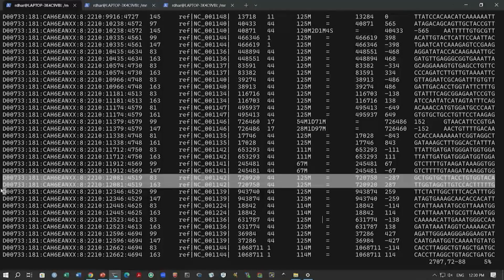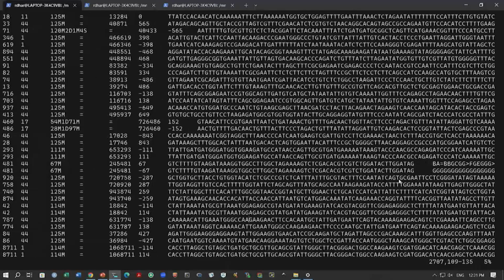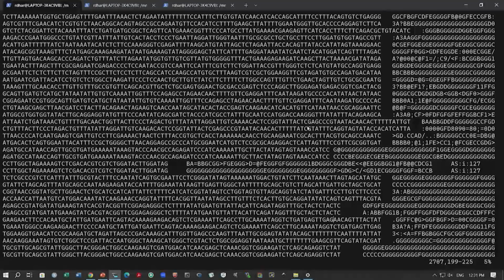As I said, the data is stored in pairs, so you have read 1, read 2 data one after another. For the mate you can see this TLEN is positive. So, this one is occurring upstream, in the leftmost position, and this mate here is occurring downstream, in the rightmost position. Hopefully these are clear. Now, these two fields describe the mapping of the mate. The next field is the sequence, where you simply get the sequence data, and then you have the quality scores as we go along.